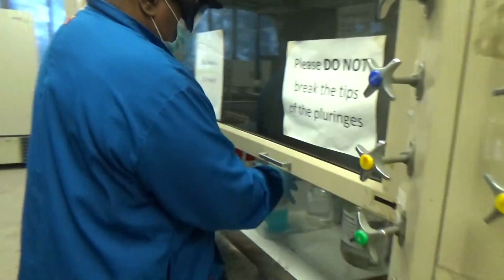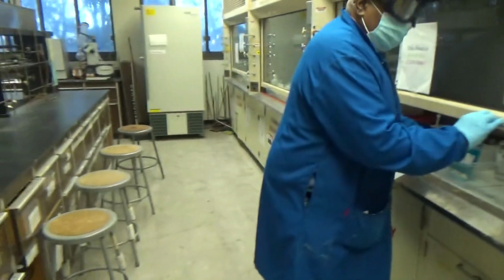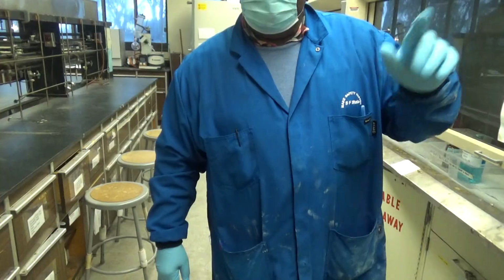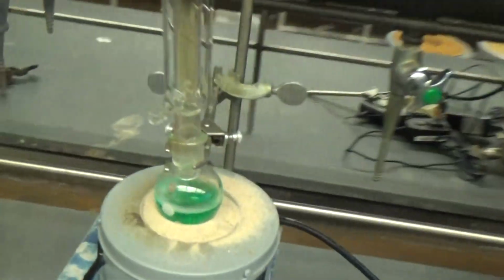That's cool because you can follow the reaction by the change of color. That's very blue. And if we were watching it during the course of it, you'd see it churn slowly from blue to green. Yes, exactly. We're on the board, so we didn't get to see it. But it's very green now.